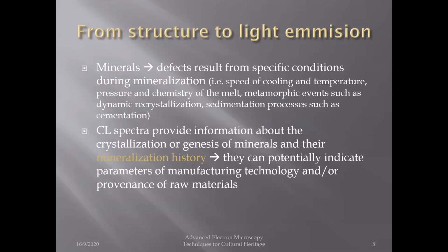If we apply this, let's say, for example, to minerals, the mineral can have various defects on its crystal structure, which have resulted from specific conditions during its mineralization.